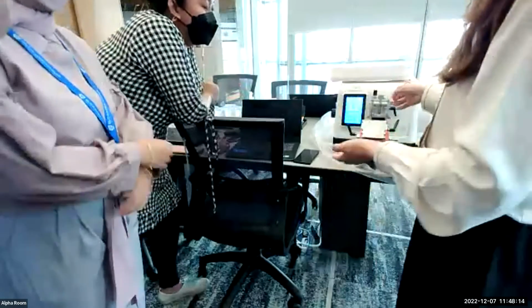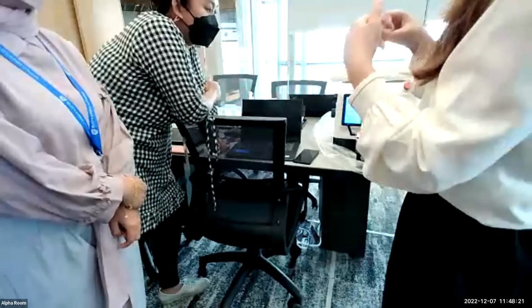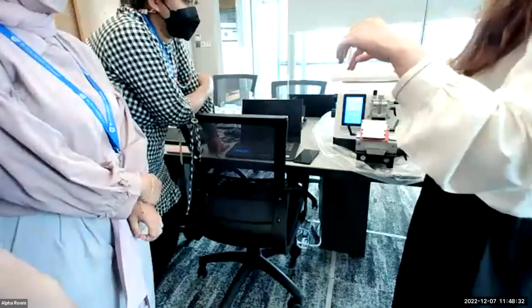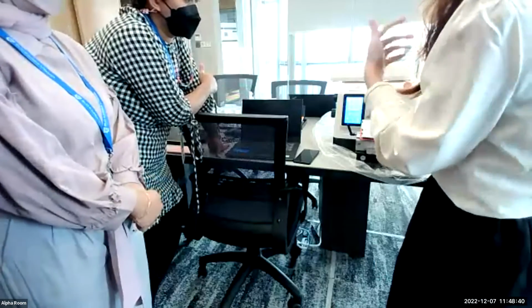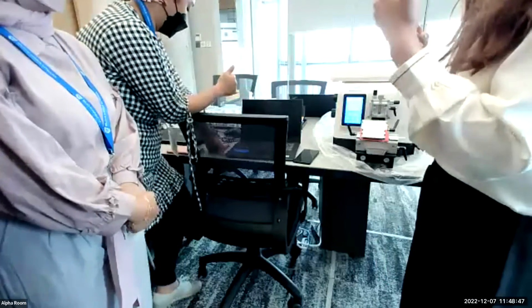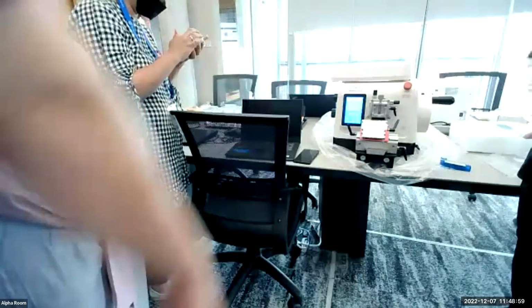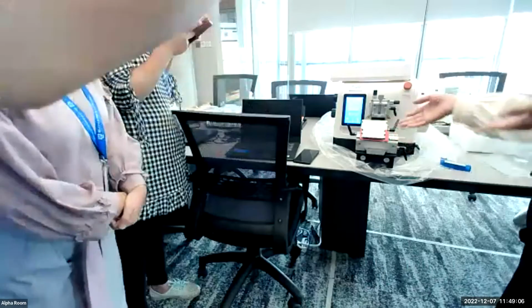But for the laboratory, maybe they know the thickness of the tissue and also the angle. So there's no need to install the program, because the tissue models are mostly the same. So they know the thickness. Yes, for that part we can install the preset. Okay, yes, we got it. That's true. Okay, any questions about that?